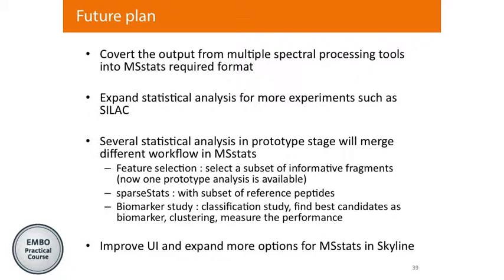We are going to keep updating the downstream analysis. Definitely we are going to improve the user interface of MSstats as an external tool in Skyline also.